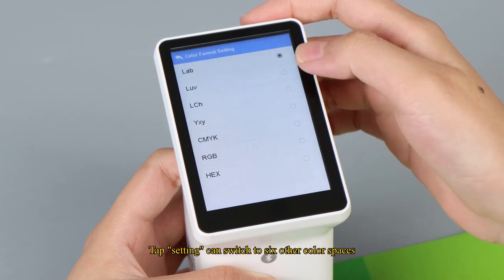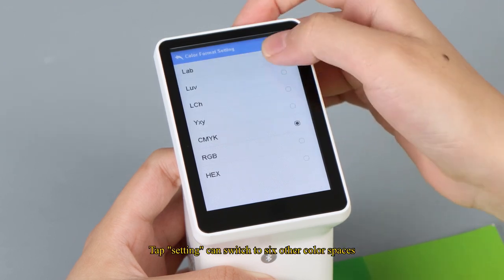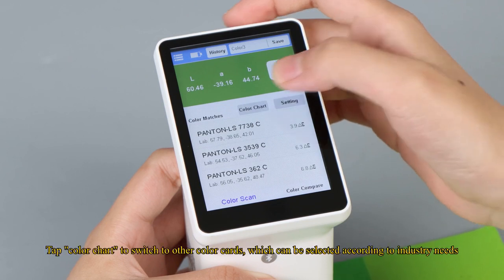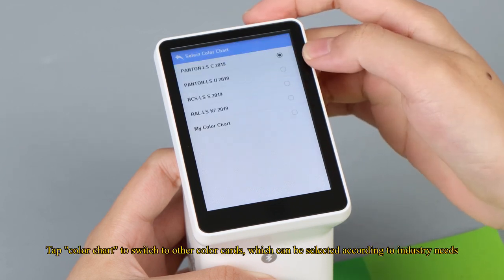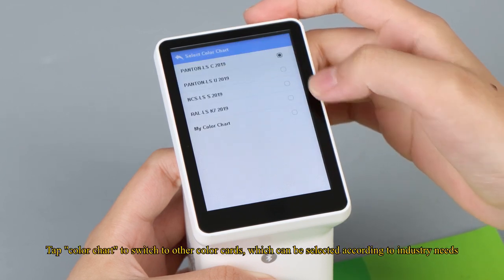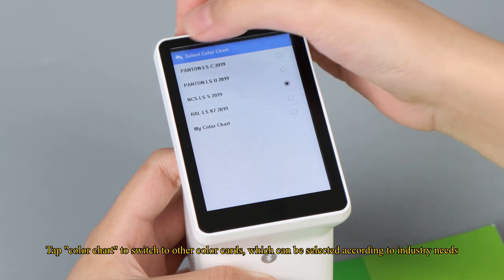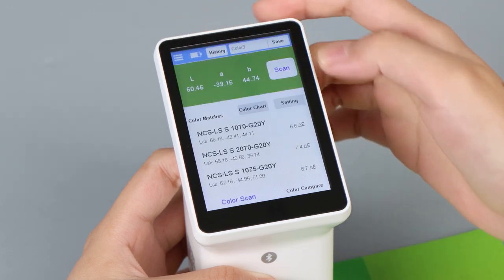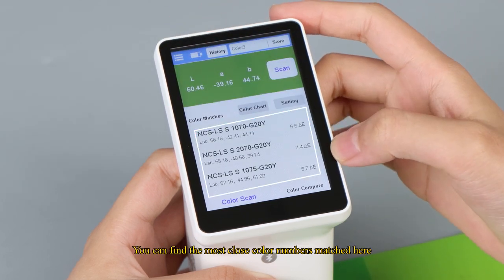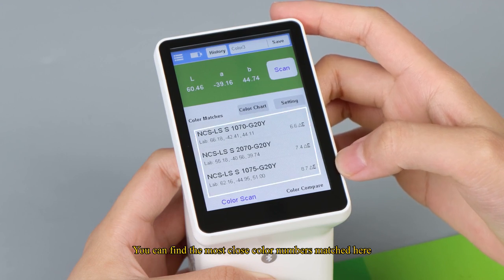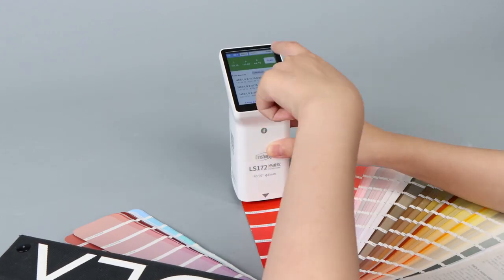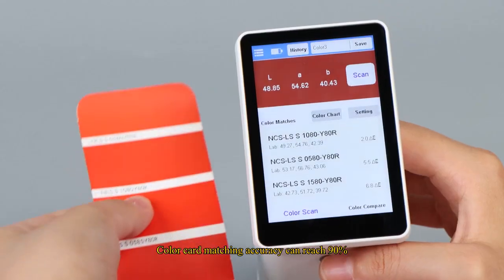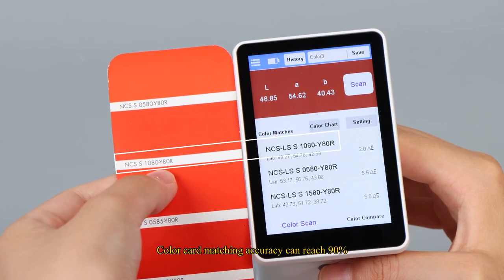Tap setting can switch to six other color spaces. Tap color chart to switch to other color cards, which can be selected according to industry needs. You can find the most close color numbers matched here. Color card matching accuracy can reach 90%.